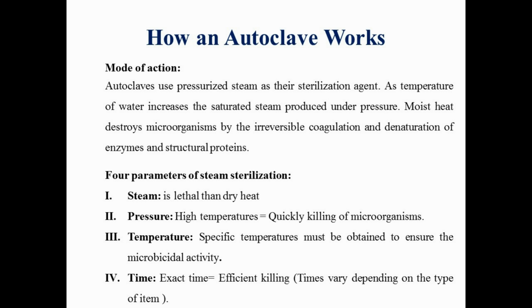Fourth parameter is the time. Time plays an important role in the sterilization process. Exact time is important to achieve perfect sterilization. Less time cannot sterilize material, while excess time may denature material, so time is the most important parameter.